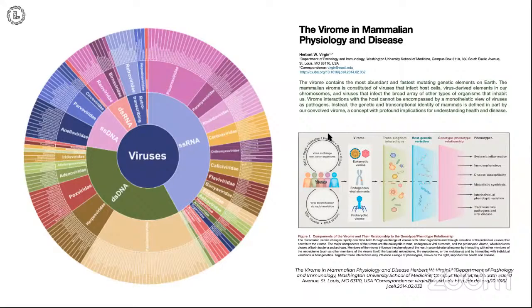And so we can analyze the microbiome for presence of different bacteria. There's a specific amplification technique called 16S amplicon ribosomal RNA metagenomic sequencing. Or we can amplify the viral sequences and study all of the genetic material and try to understand whether there's also a presence of viruses.